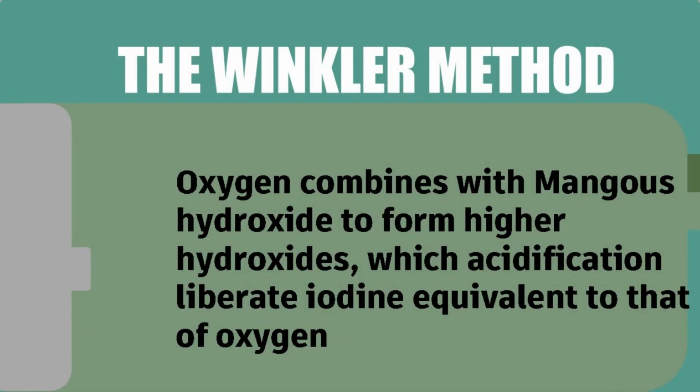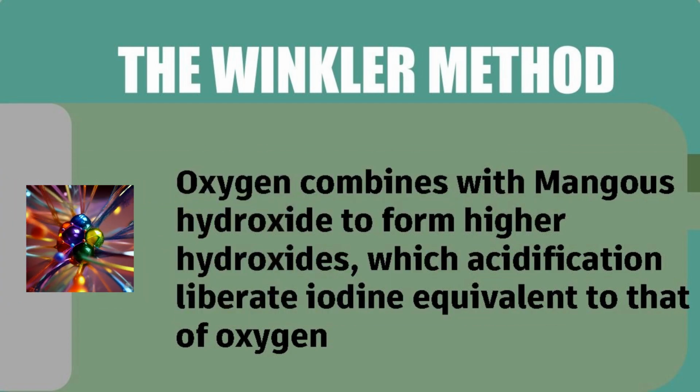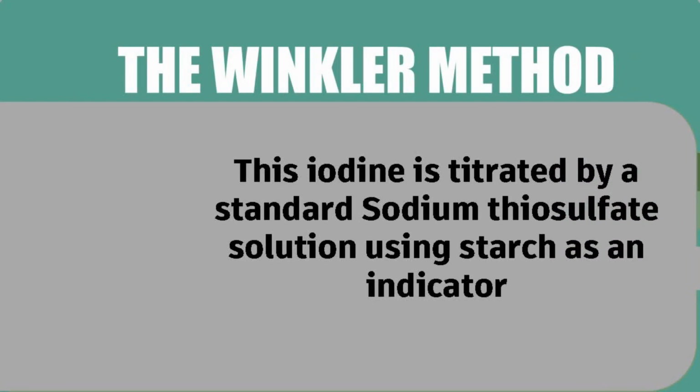Oxygen combines with manganese hydroxide to form higher hydroxides, which on acidification liberate iodine equivalent to that of oxygen. In simple terms, when oxygen comes into contact with manganese hydroxide, they react to form a new compound called a higher hydroxide. If this compound is then exposed to an acid, it releases iodine. This iodine is titrated by a standard sodium thiosulfate solution, using starch as an indicator.